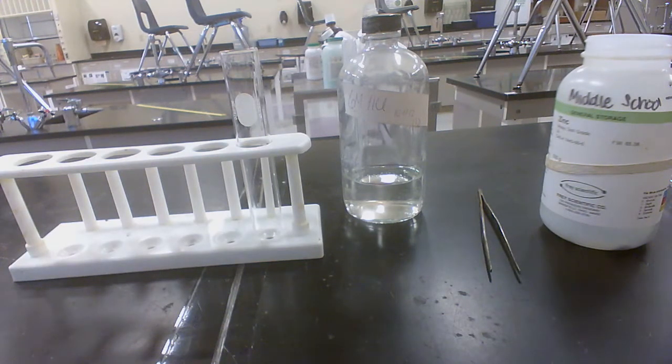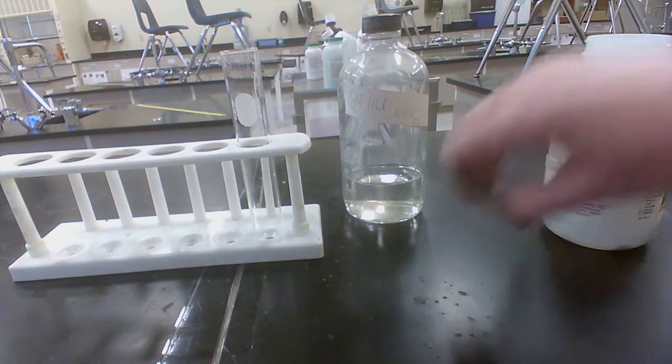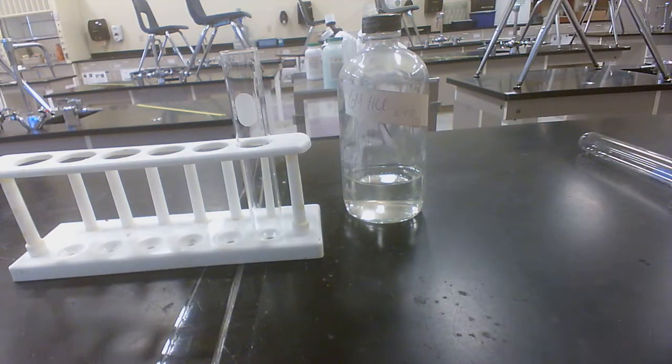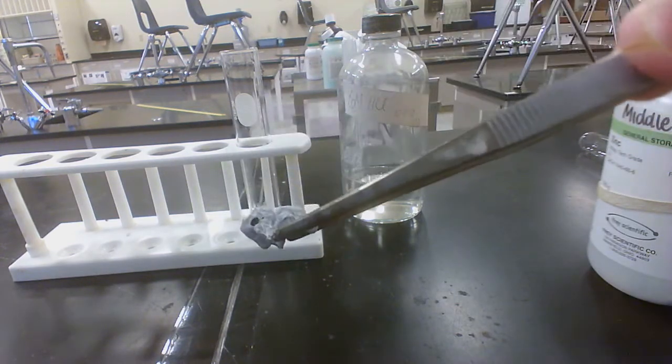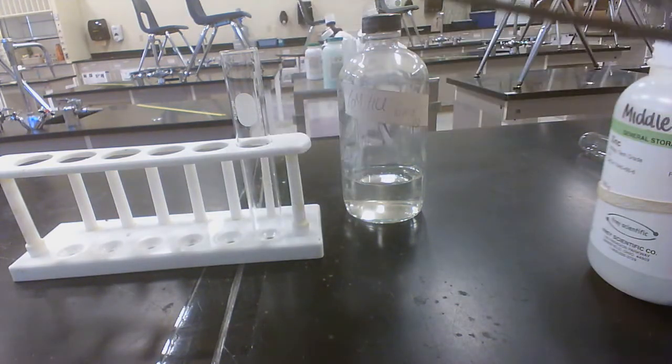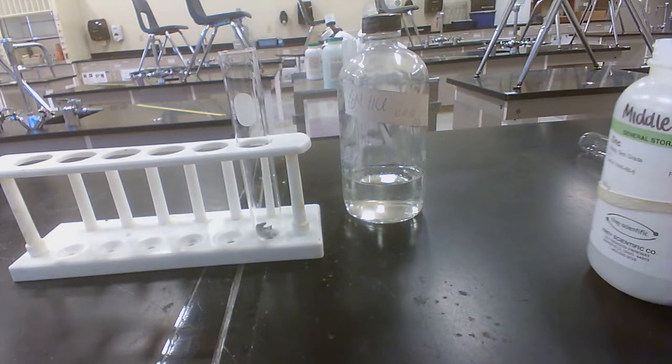Okay, let's react a piece of zinc with some aqueous hydrogen chloride, otherwise known as hydrochloric acid. Here I have a piece of zinc. As you can see, it is a solid. You can hear it clink when I drop it into the test tube.